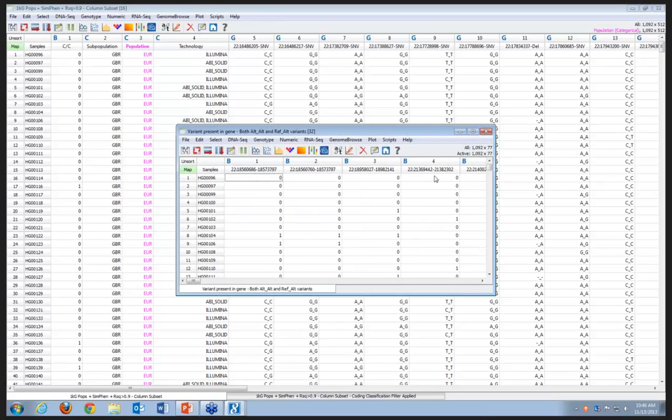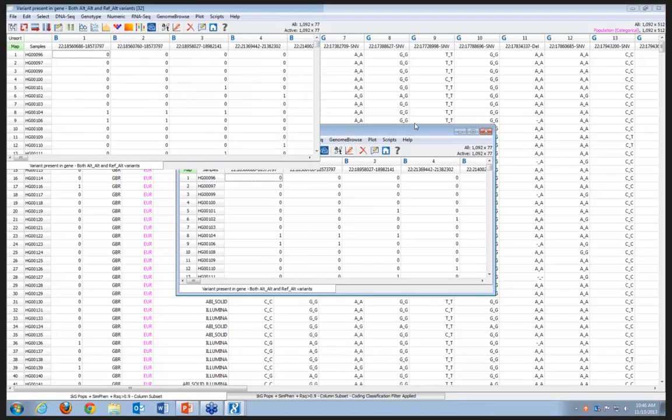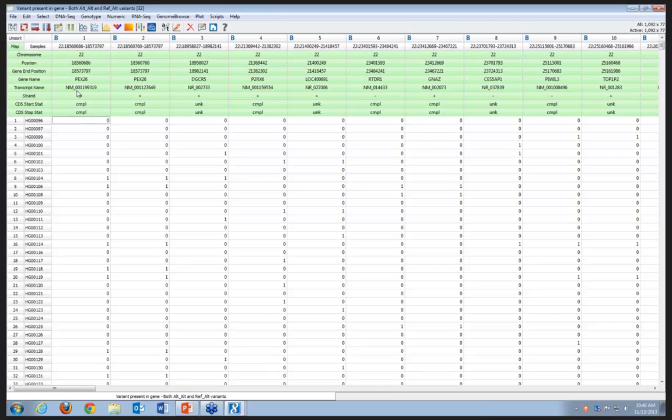And we get our results here. Again, we have samples in rows, so 1,092 rows. And then each column, it's not actually a gene. It's technically done transcript by transcript, so that's why we see two different columns here with the same gene name. But we can look around and see this sample has at least one variant in that gene. This sample has at least one variant in that gene. And this is a representation that's very similar to what is happening in the background on collapsing tests.